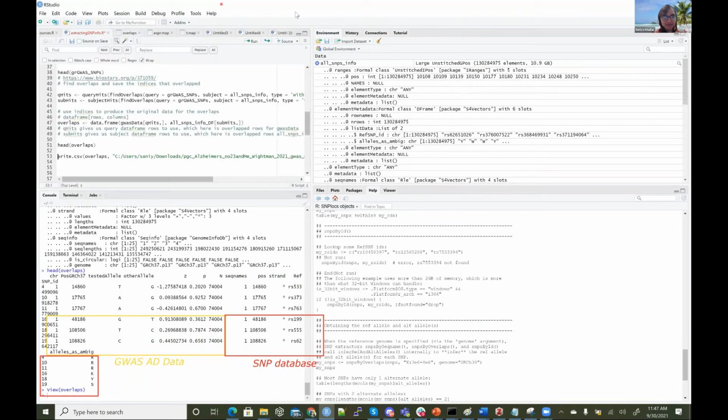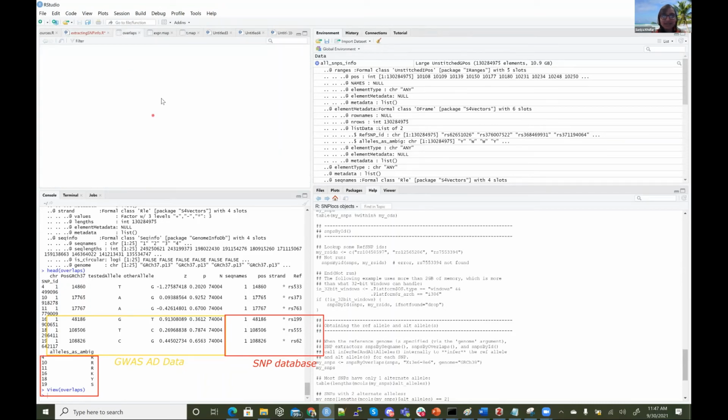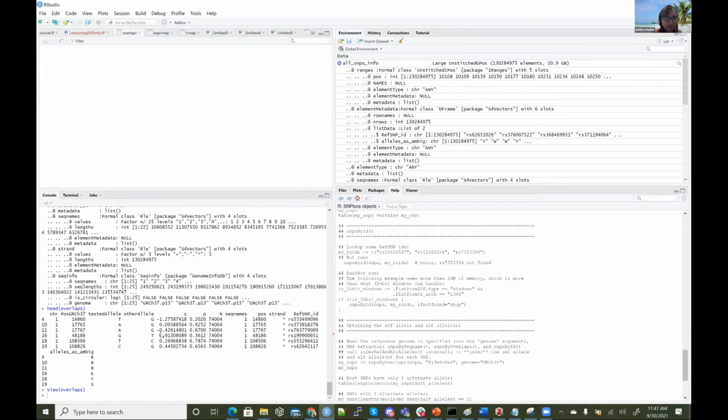Going to take some time, so I'm not sure if that was a good decision. So that's just, in other words, how you can see all of these chromosome positions that you want. Instead of viewing this, let's just also view rows 1 to 50. Like just see the first 50 rows.